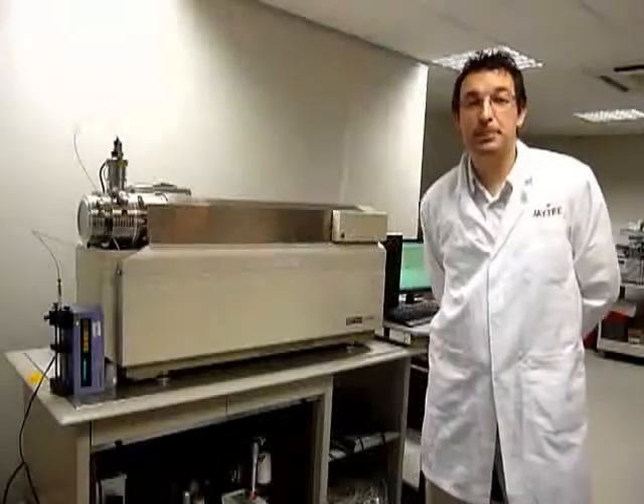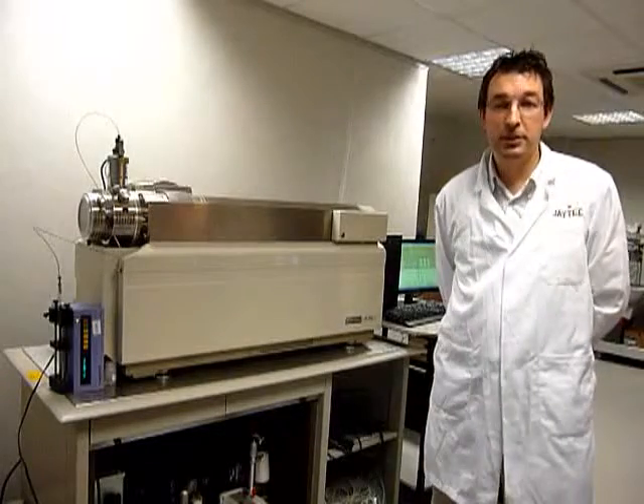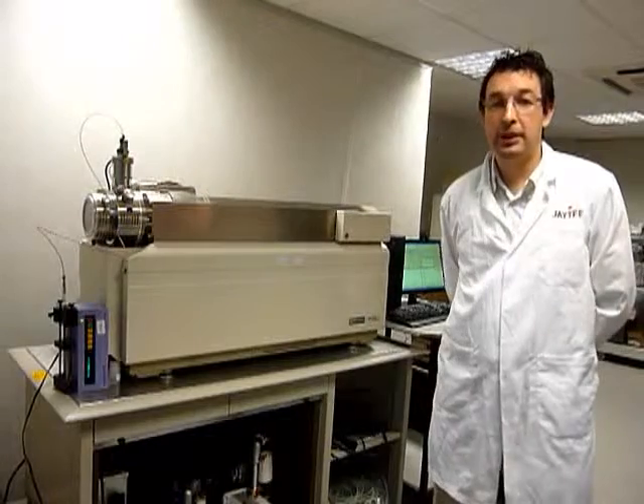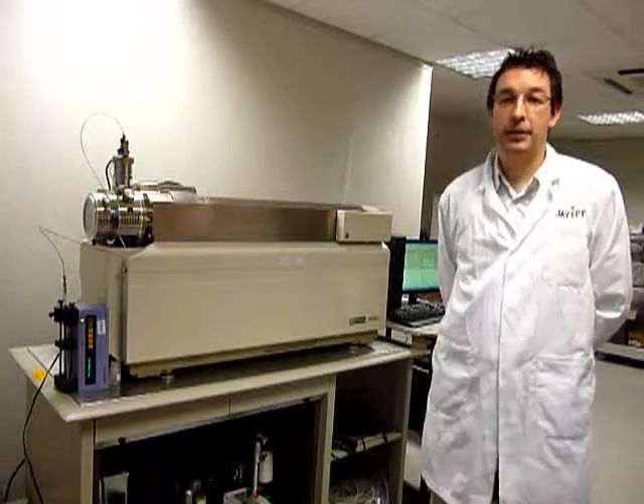For all our latest offers, please view our website: www.msforsales.co.uk. We have all our latest instruments, along with all the calibration and tuning data that we upload to the website for you to view, to prove the instruments are quality and fully refurbished.